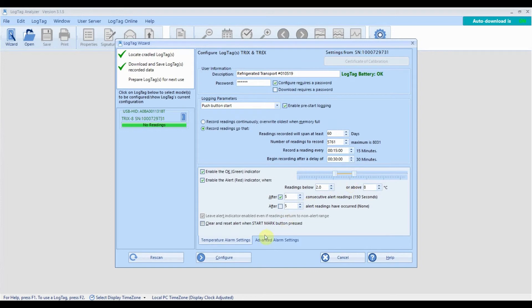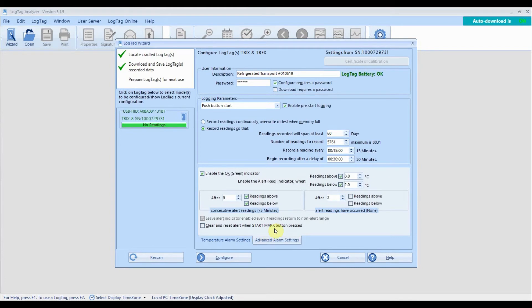There are additional options available on most loggers. Click on the available tabs and customize the settings to meet your requirements.